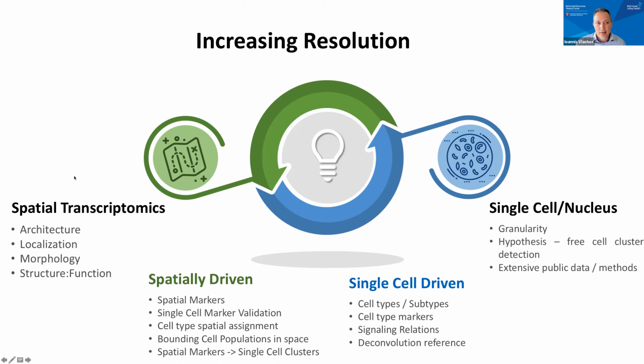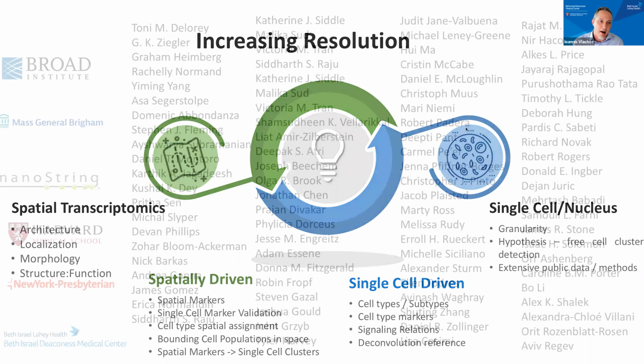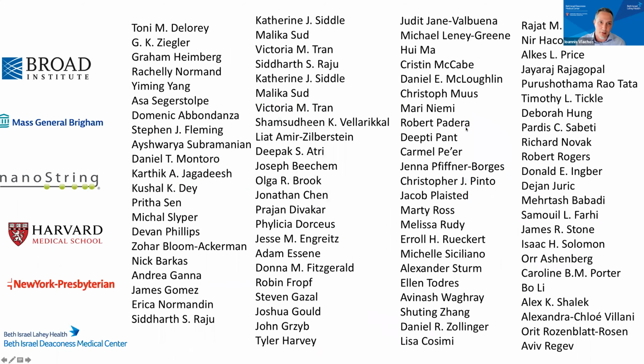And that I think is key. There will be a point, again, this is another quote, and it might not age well, but I think this one will definitely age well. There will be a time where spatial will not need that much the additional component of single cell at the same time, because you will have the granularity and the capture rate, and the methods will be more mature. But for now, if you want to get there, having both at the same time really helps.